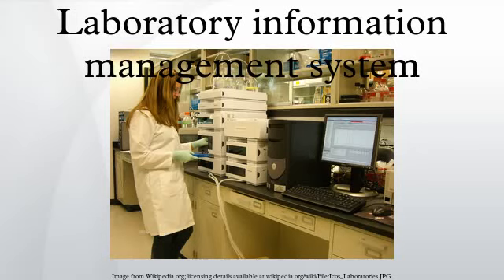A laboratory information management system, sometimes referred to as a laboratory information system or laboratory management system, is a software-based laboratory and information management system that offers a set of key features that support a modern laboratory's operations. Those key features include, but are not limited to, workflow and data tracking support, flexible architecture, and smart data exchange interfaces, which fully support its use in regulated environments.